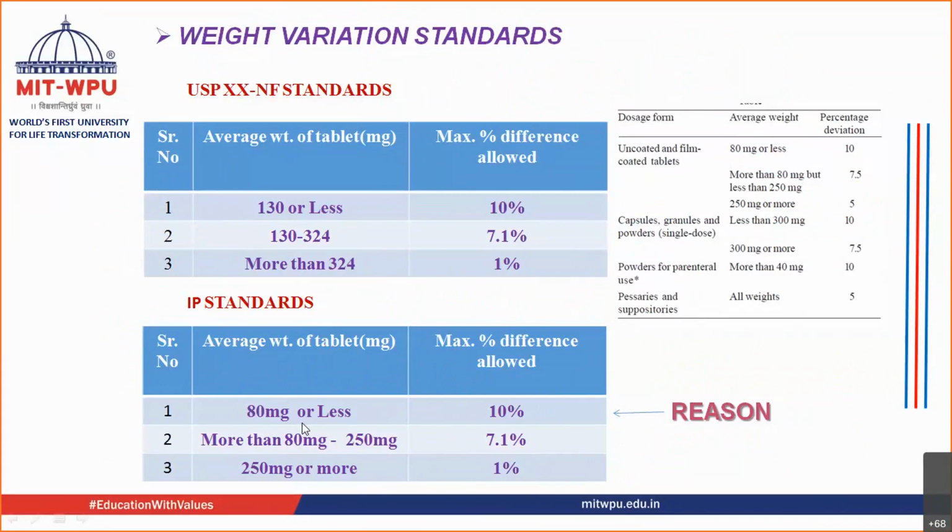That is the difference. Here it was just 1 milligram after 10% deviation, whereas with 5% deviation, it has gone to near about 33 milligram.